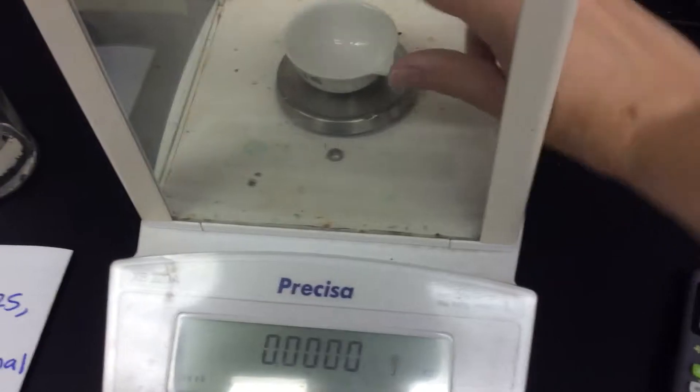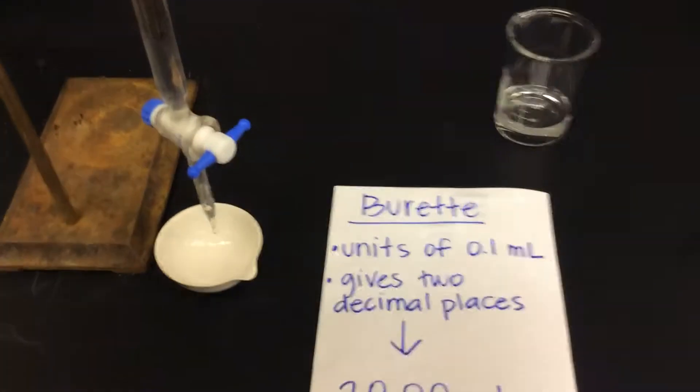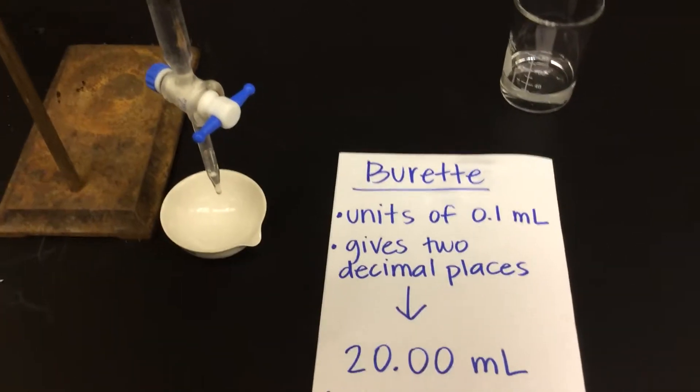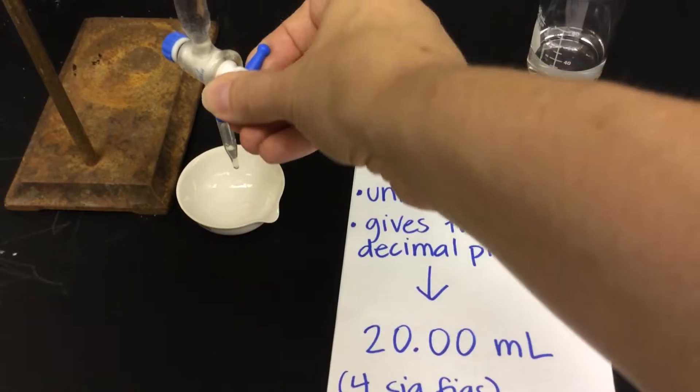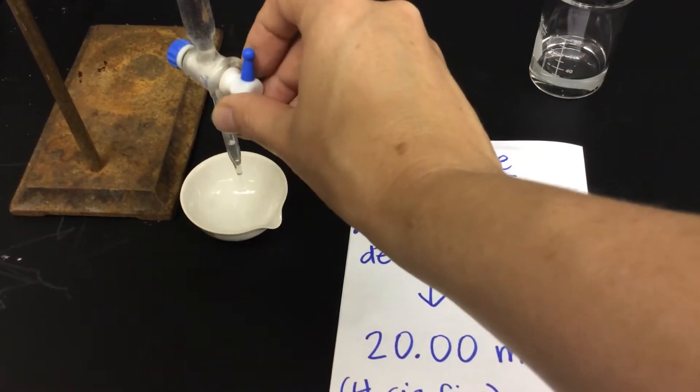And then I'm going to take our dish over to the burette. Now we just talked about the burette in the previous video. The burette is a very accurate measurement for volume. So we're going to dispense 20.00 milliliters from the burette.